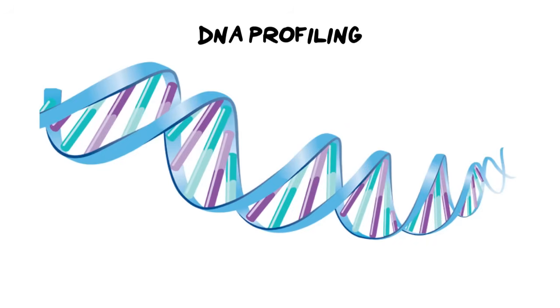I am Miss Angler. In today's video, we are going to be looking at DNA profiling. I'm going to walk you through how they create a DNA profile, and most importantly, I'm going to show you how to read one in an exam or a test, and how to explain the reasons why you potentially chose the person or the victim or the parent from the choice, making sure that you get full marks every single time.